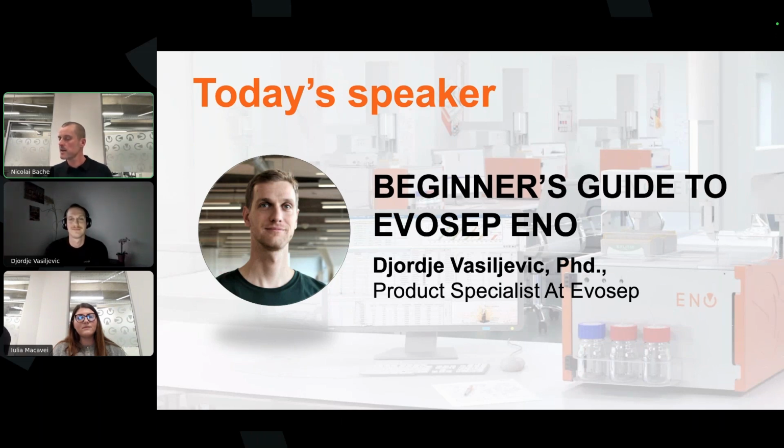Last question. You kind of covered it during your talk, Djordje, but the question is basically around the source heating: is MS source heating required for all methods on the Evosep? Yes. So is it Evosep or OEM parts that we need for this? And maybe you want to elaborate, Djordje, on that topic.